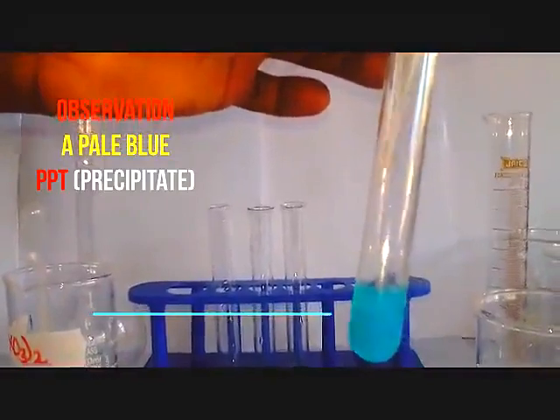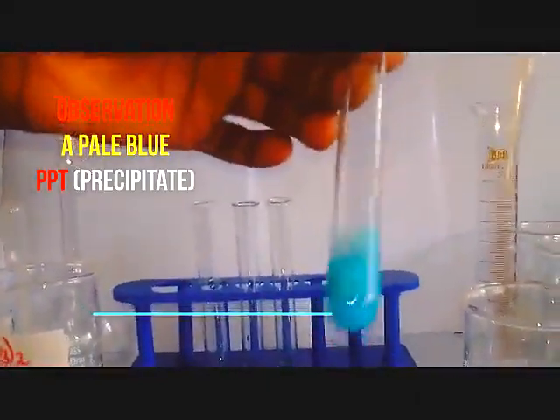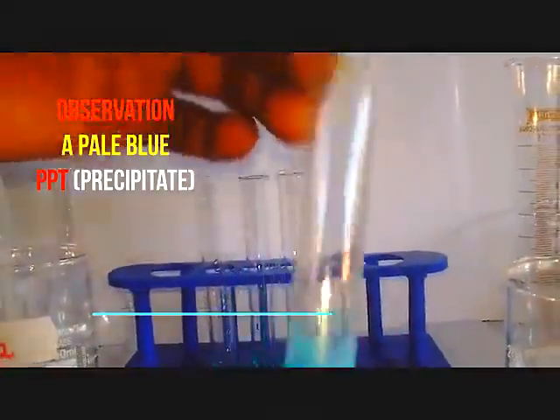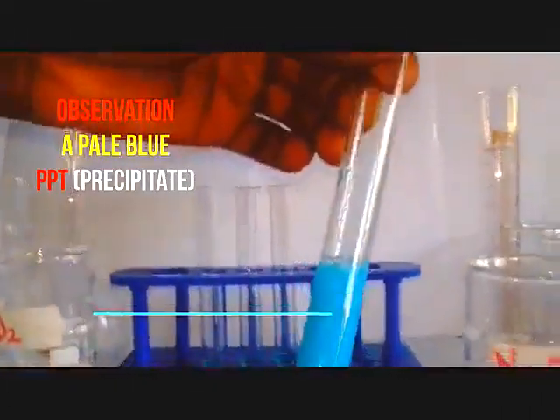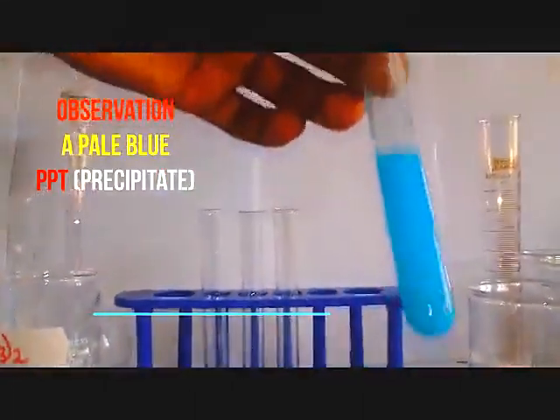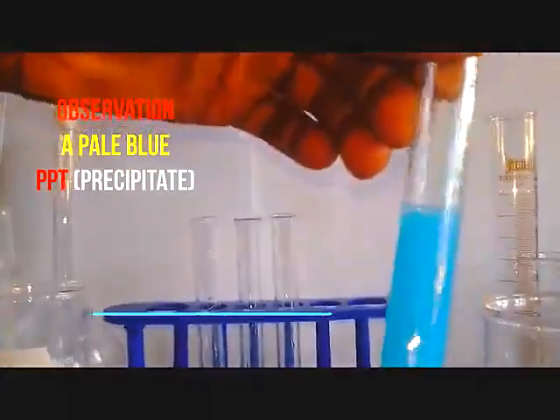So we add. I think you can see a blue precipitate, or you can say a pale blue precipitate. So let's add and see whether it's going to dissolve. We are seeing our PPT is persisting. So this excess is enough, or you can add if you want.